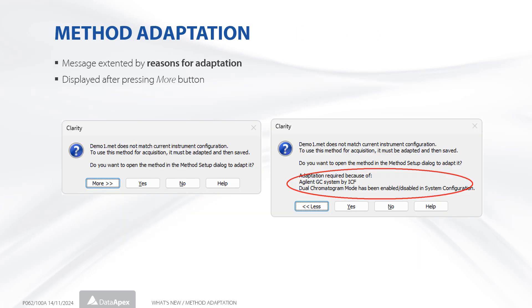The method adaptation message will now include information about the control modules and other reasons requiring method adaptation. Methods from previous versions of Clarity may therefore require a one-time adaptation.